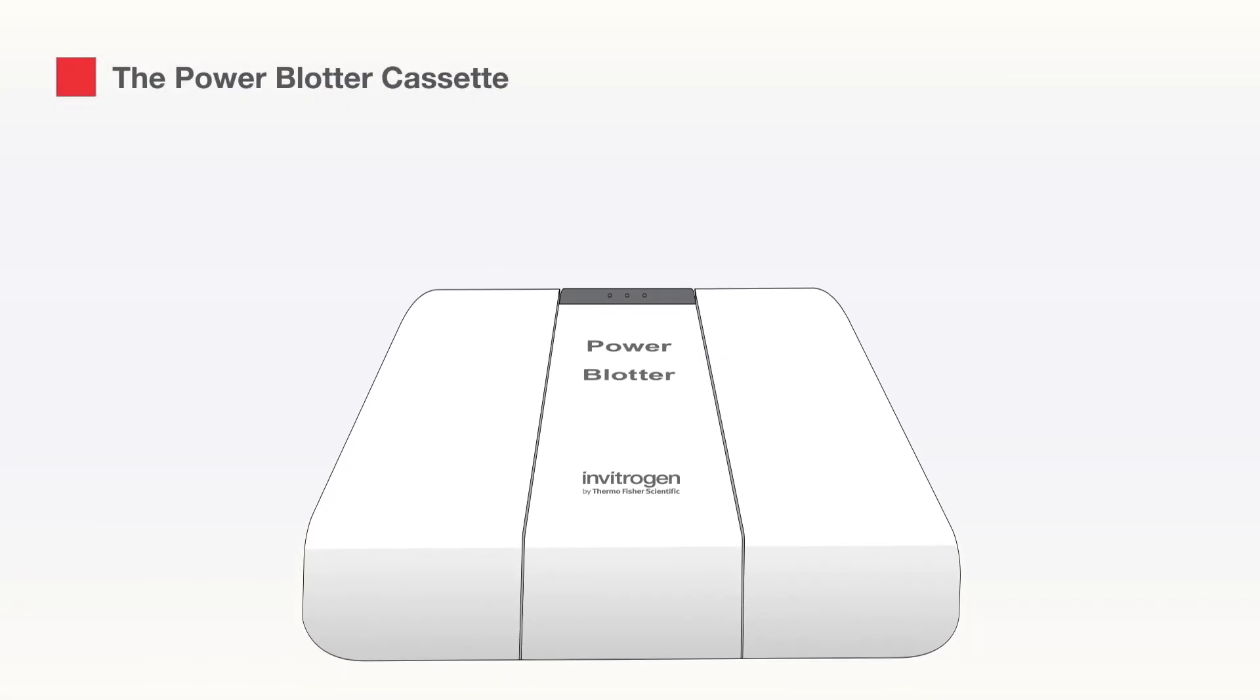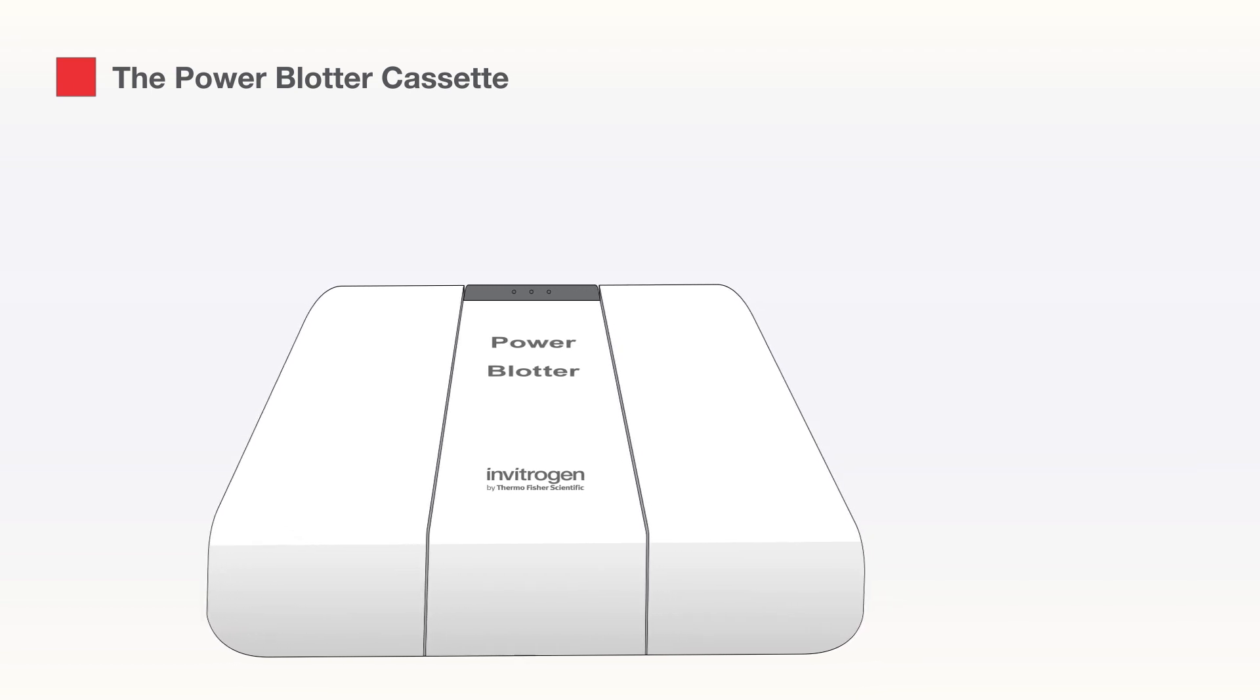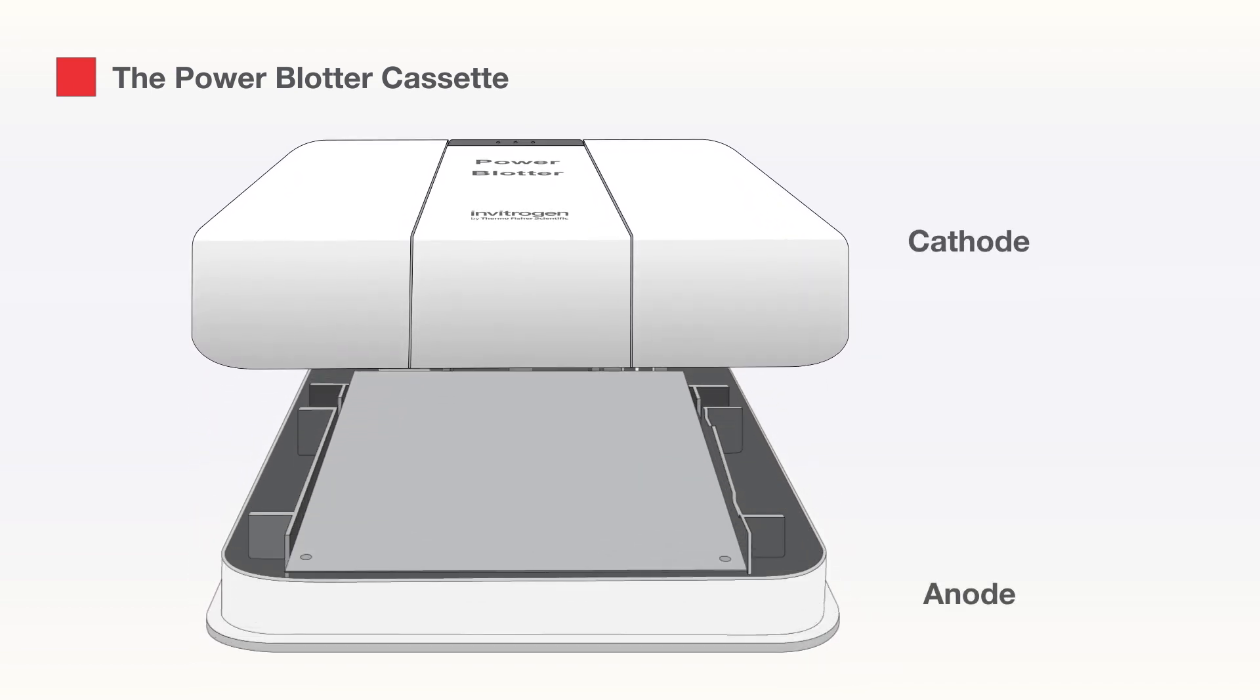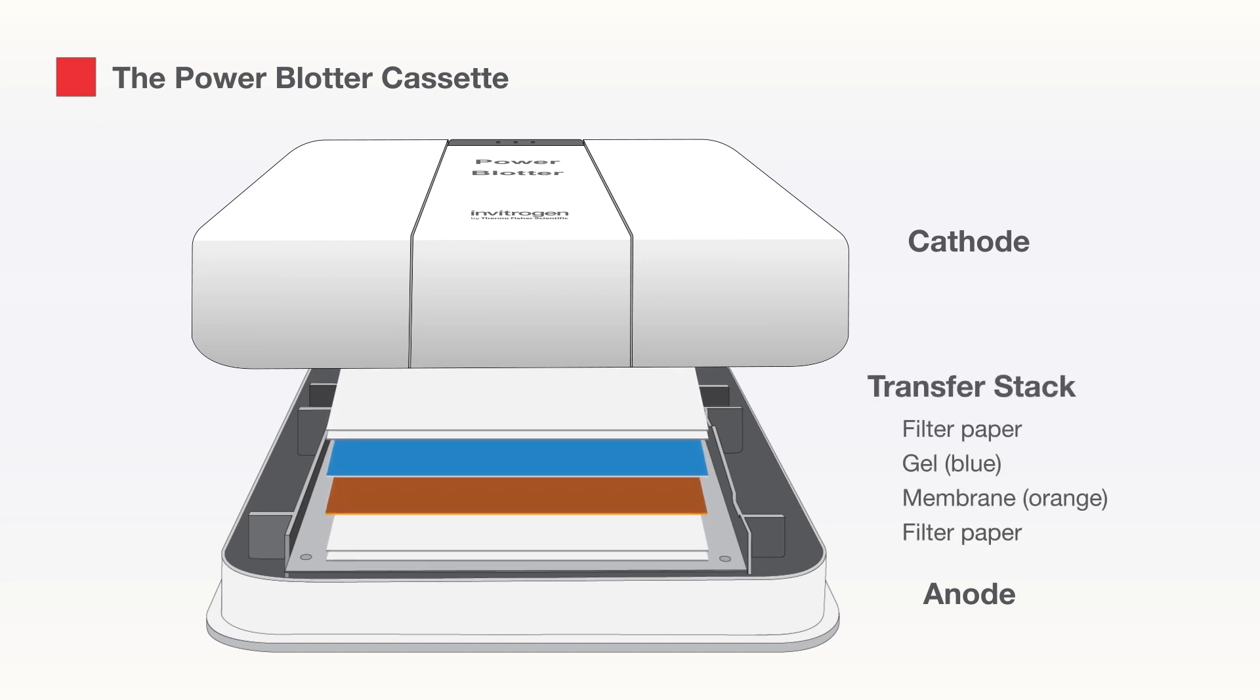In the Power Blotter system, the cathode and anode are plates that are fixed to the top and bottom of the cassette frame, and the transfer stack is placed in between them during the transfer process.